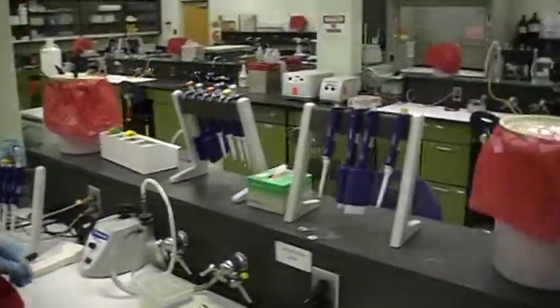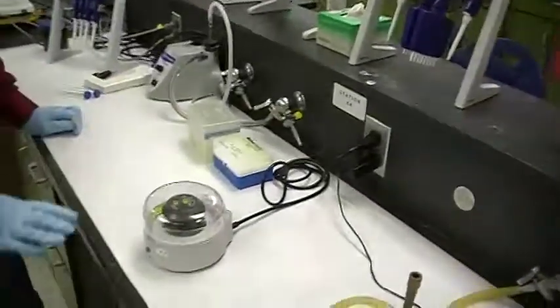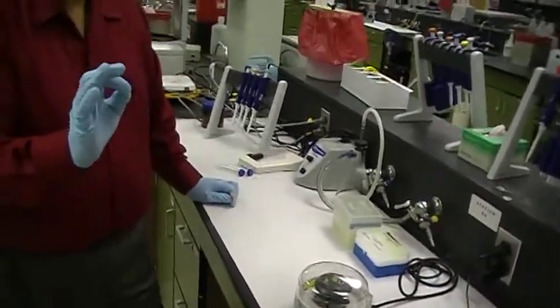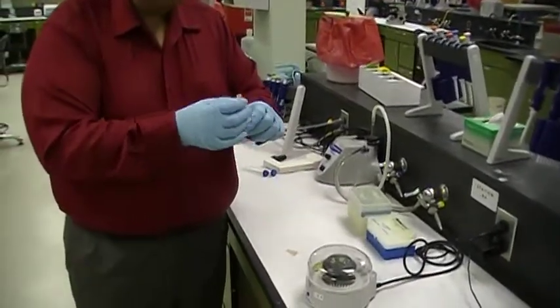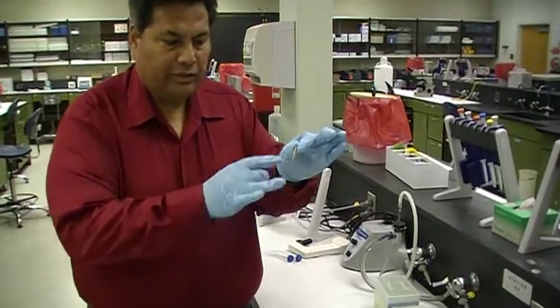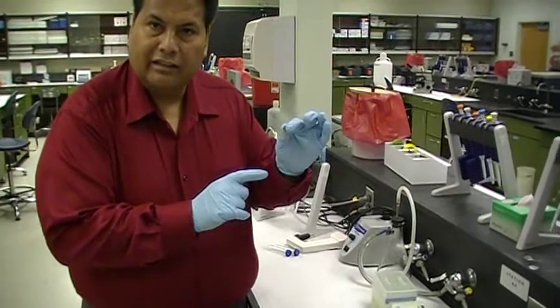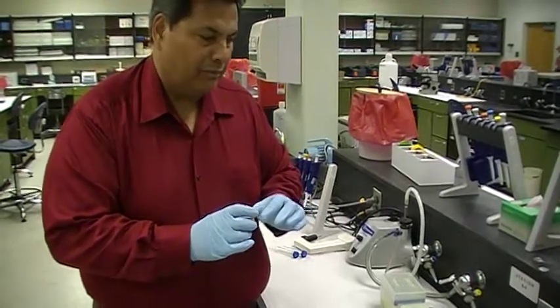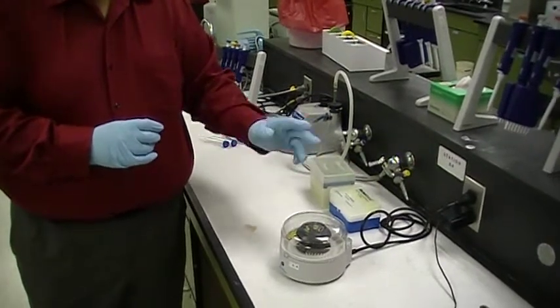The first one is a tabletop microcentrifuge — a very small one. The reason why we use this is simply to centrifuge down the liquid after you mix up your samples. Let's say I'm mixing a number of volumes in this microcentrifuge tube. After I mix all that, I flick it with my finger, and all the liquid is on the side. I have to pull it down to the bottom before I can incubate at the proper temperature. You use this tabletop centrifuge — it doesn't go as fast.